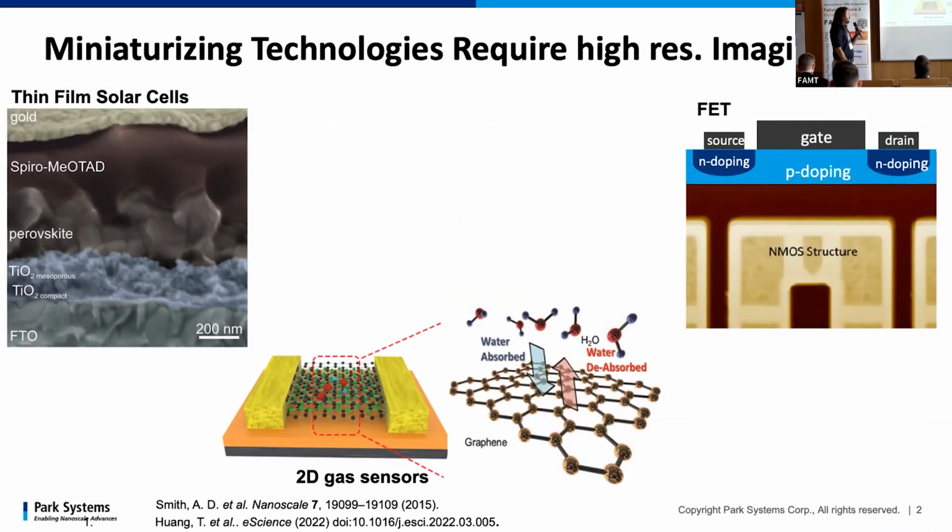regime. The same accounts for different field effect transistors, where we have to understand the different electronic properties on a nanometer scale. But I think the most prominent candidate that exemplifies our ever-progressing miniaturization are 2D materials that might pave a way to single atomic layers as the key functional component in modern applications, be it, for example, 2D material gas sensors or pressure sensors, electronic sensors, or functionalized membranes, or any other kinds of systems.